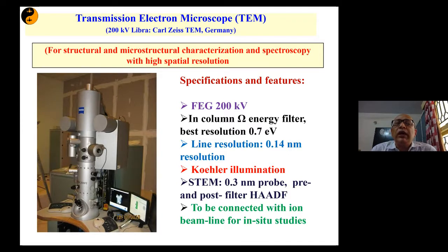And right now, at least one of them is on, which I will show you later. This particular transmission electron microscope, right now we are doing certain repair work, and it will be on hopefully in a couple of months. So one can write to us for the use of transmission electron microscopy if required. We will enable using the facilities either in UGC DAE CSR, or IGCAR.